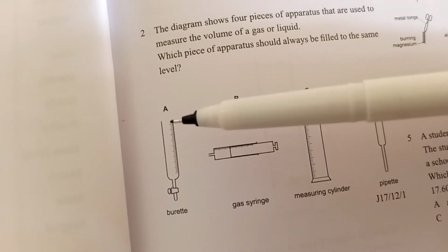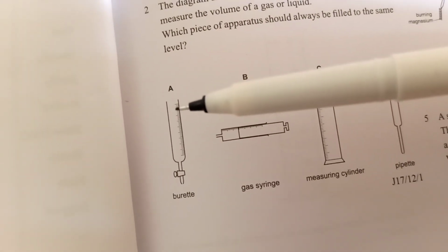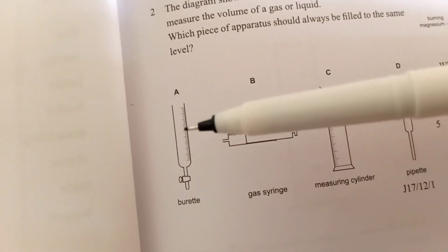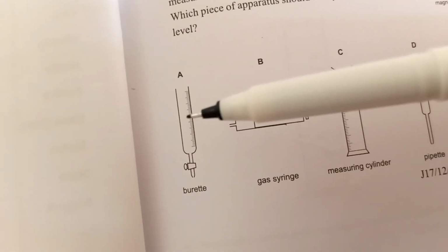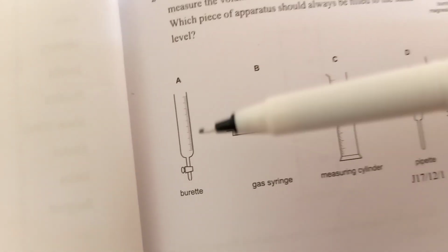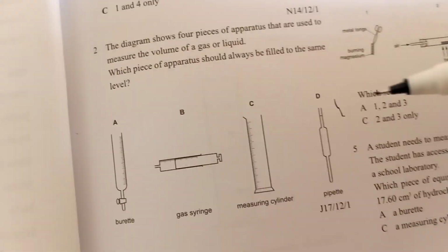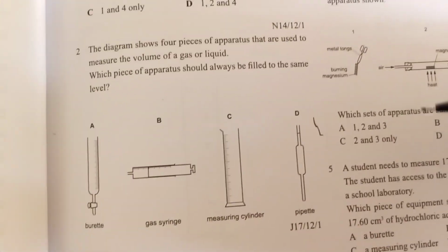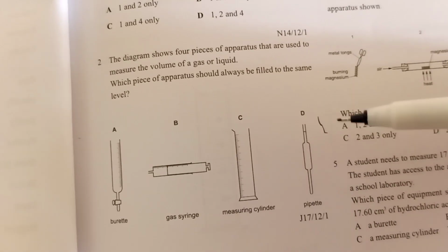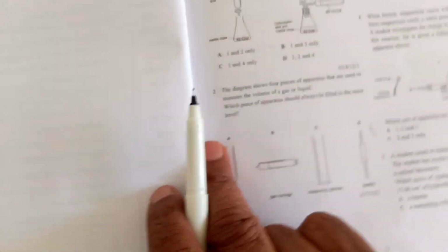Here we can remove, or we can put in a conical flask 20 centimeter cube, 15 centimeter cube, 21.5, any volume you want. So the answer to which apparatus should always be filled to the same level is the pipette, the 25 centimeter pipette used in titration. These are the answers for the first 2 questions.